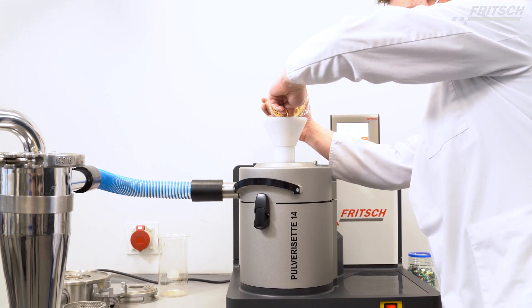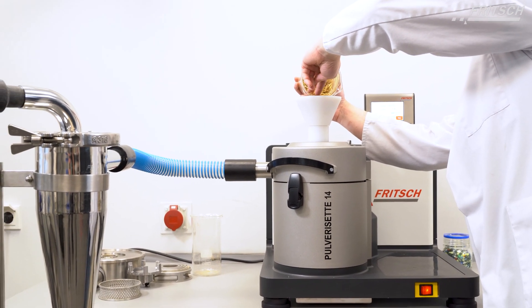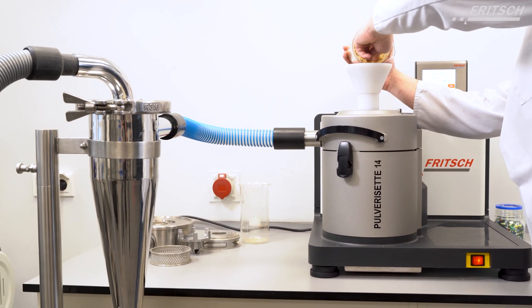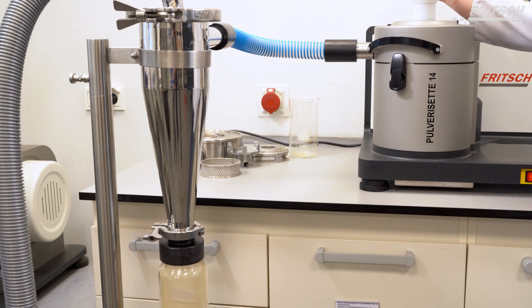Regardless of whether you use the instrument as a variable speed rotor mill or a cutting mill, only the combination with a Fridge cyclone separator and exhaust system for sample exhaustion delivers optimal results.